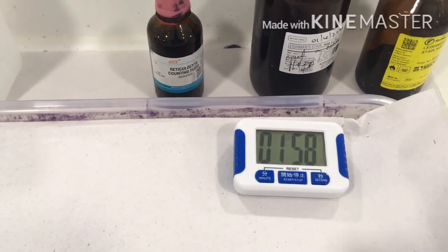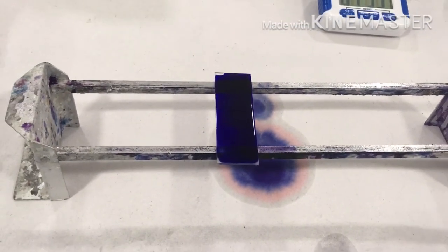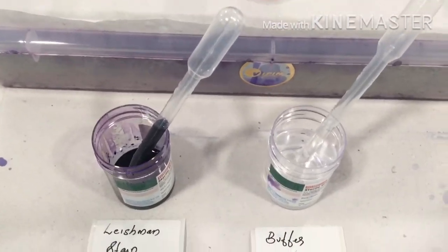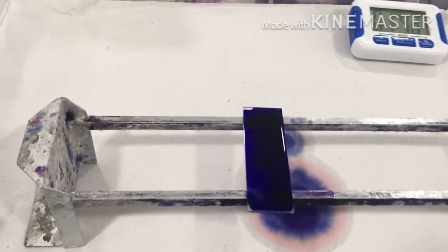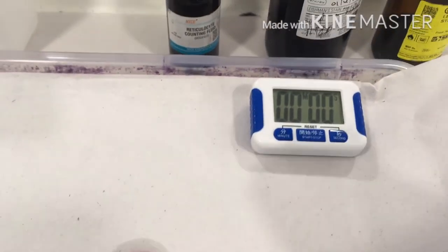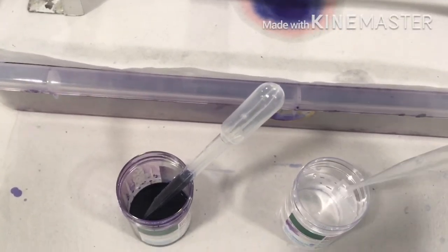So the actual procedure is we add the Leishman stain, wait for 2 minutes, then add buffer. The buffer which we use here has a pH of 6.8, slightly acidic. Okay, 2 minutes is over. Now we can add the buffer. How much buffer? It's actually double the amount of the stain.